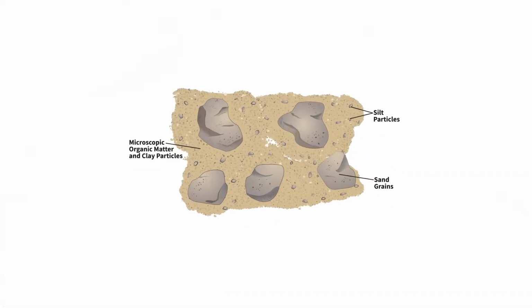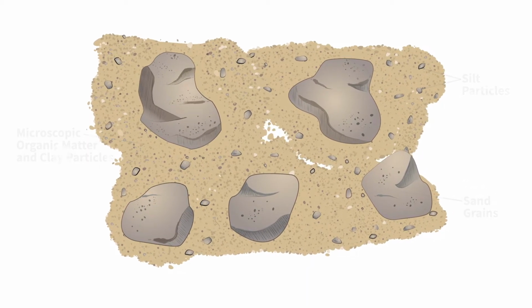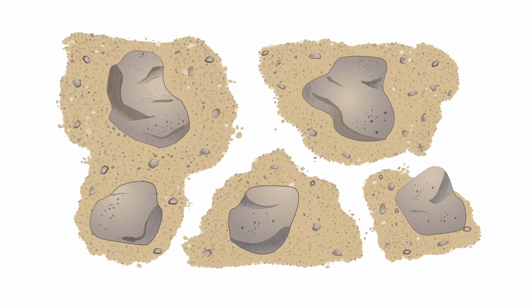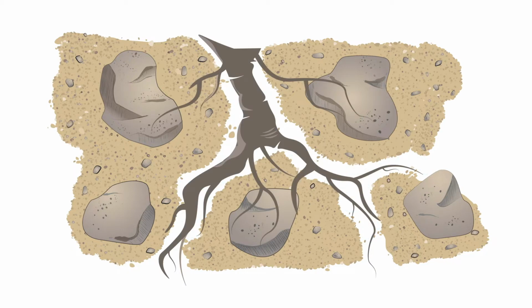What are soil aggregates? Soil aggregates are clusters of soil and organic matter that are bound together and can be broken apart from other soil particles. A healthy soil is likely to be made up of tiny microaggregates that can agglomerate into larger macroaggregates, creating many pore spaces for gas exchange, water percolation, and root growth. These aggregates are held together by biotic glues excreted by microorganisms and plant roots.